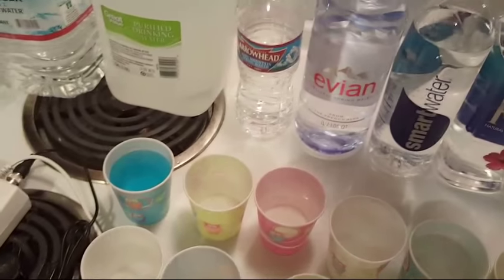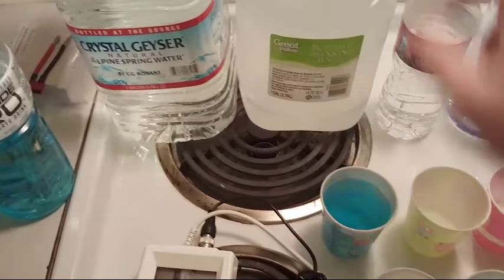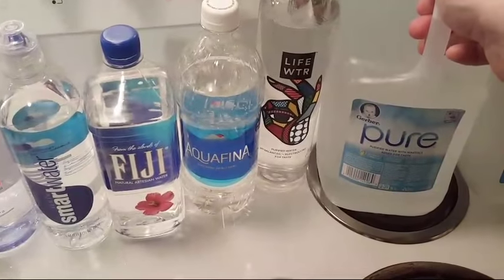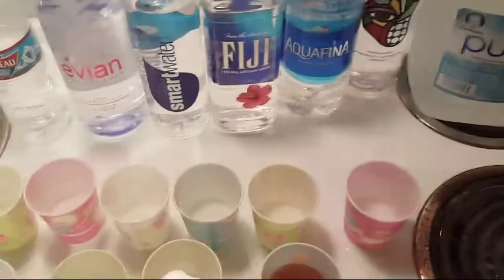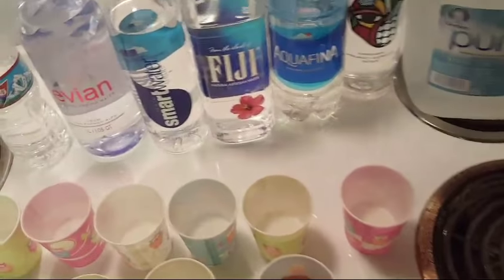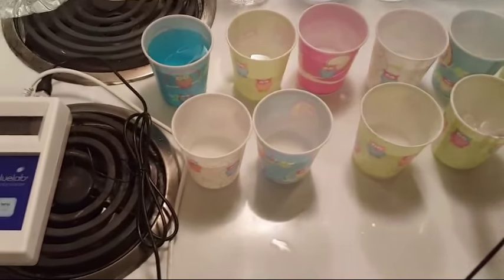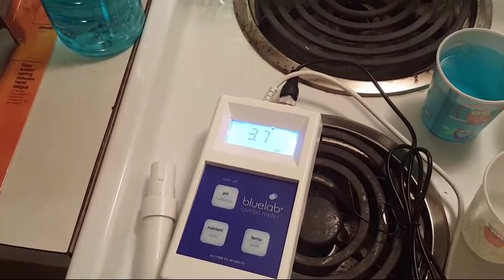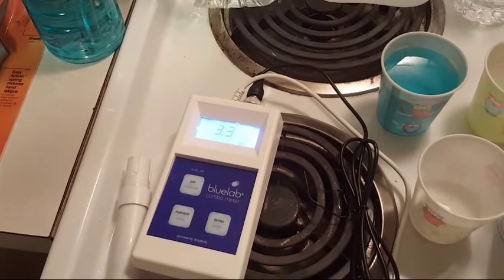Fiji has a lot of good stuff, Evian has the most. Arrowhead and Crystal Geyser are right around 80 PPM so they don't have as many minerals, but if you want something affordable with a lot of minerals and a good pH, go with Gerber Pure — it's inexpensive and easy to find at Walmart. Now let me show you the beer before the battery dies: look at that — 4.0, going down to 3.7, 3.5, 3.4. Very acidic.